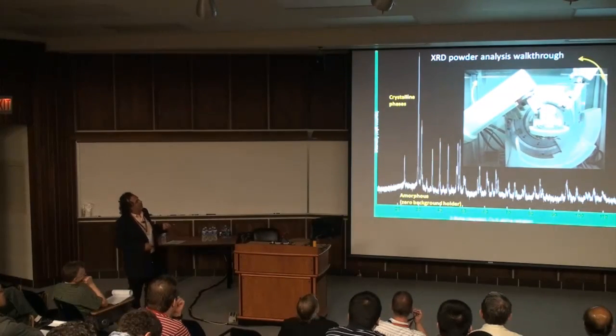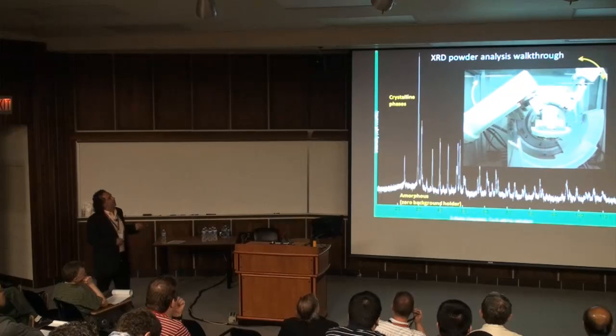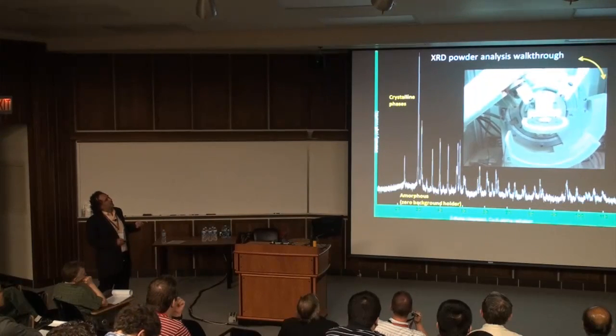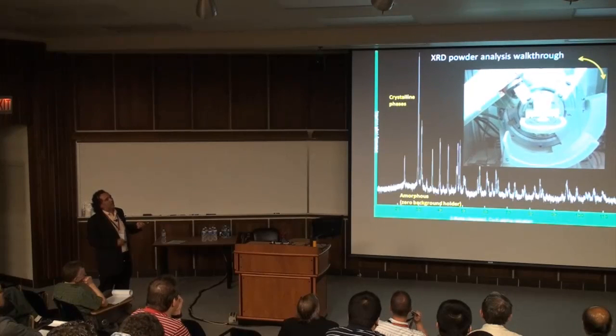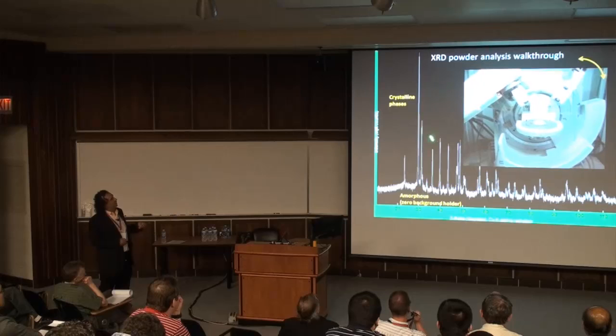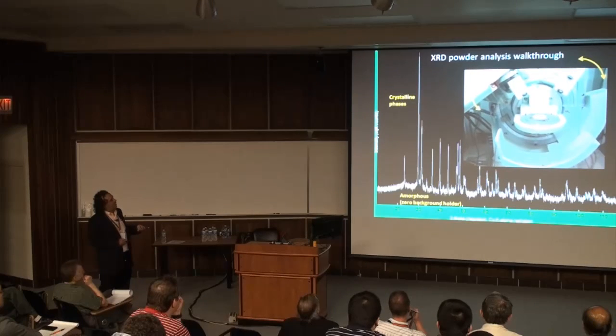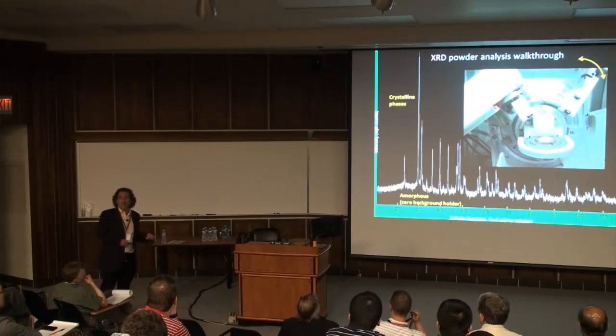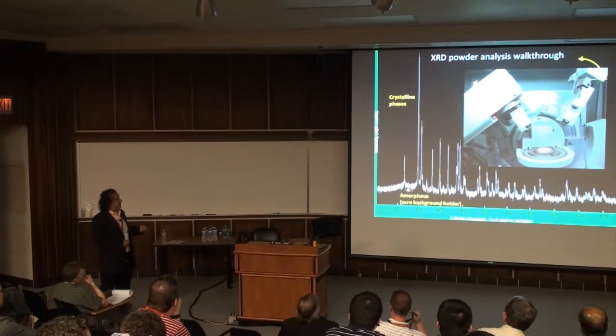This is the X-ray machine that we showed in the tour. The most important thing here is not the sample rotation that's going on, it's the tube rotation and the detector rotation. This is the 2 theta omega scan. You can see the data already acquired. You have diffraction peaks, but you also have a hump that typically suggests you have amorphous content. I knew because I added the amorphous, but that's the signature of it.